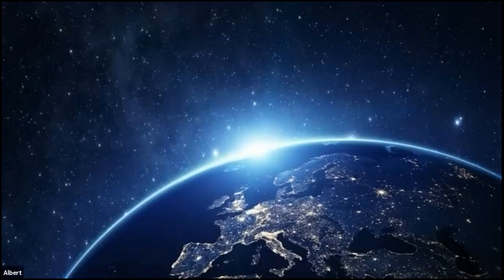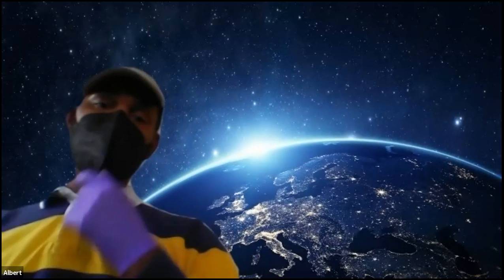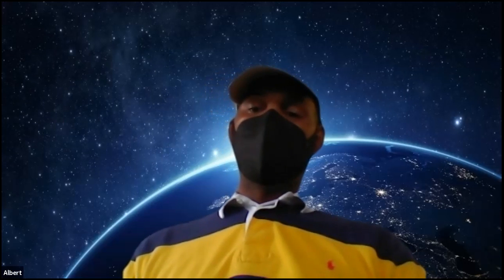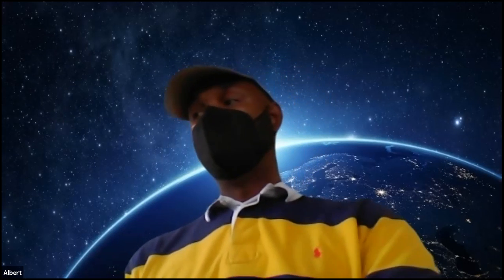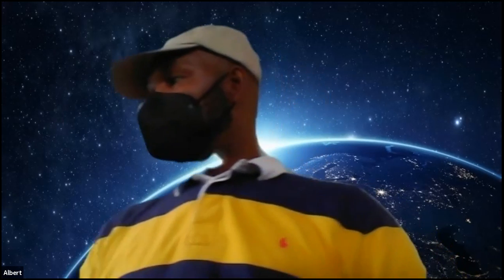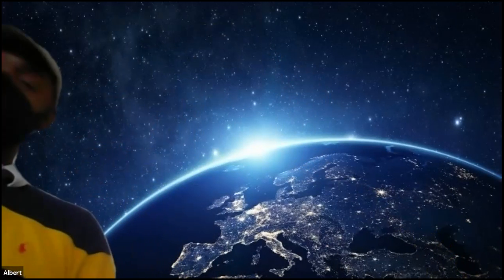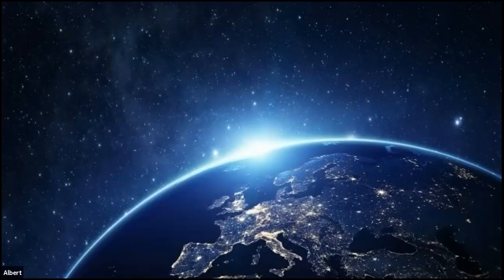And again, anytime you have a solution that is potentially oversaturated, one way to fix it is to seed it. Another way, again, is to scratch the glass on the side, but I don't have a glass rod handy. So we're just going to continue to try again to see. I can see now without action now. It's going to, boom, just watch. Just watch.